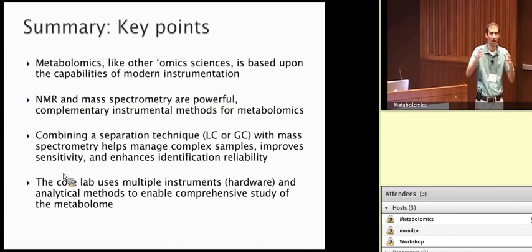Yes, we get a lot of that signal. For the knowns, for the things that we have a library match, we have a pretty good idea that yes, we're looking at the real peak or the most abundant fragment that's best to quantitate off of. For everything else, we use the computational tools that are out there, and then really sorting out the rest of it requires some more good manual work. And when you get to that point in an experiment, the core lab can help you do that, and will help you do that. We'll give you our best effort, and we're developing tools right now. This is sort of an unsolved problem in metabolomics, not a problem that's unmanageable. It still all has useful data, but a problem that's really of interest to the field to get that data set condensed down to just authentic metabolites.